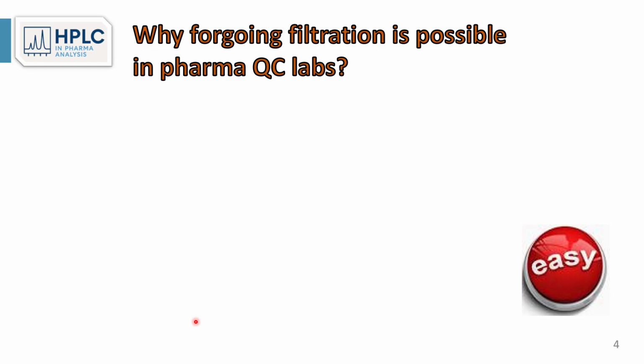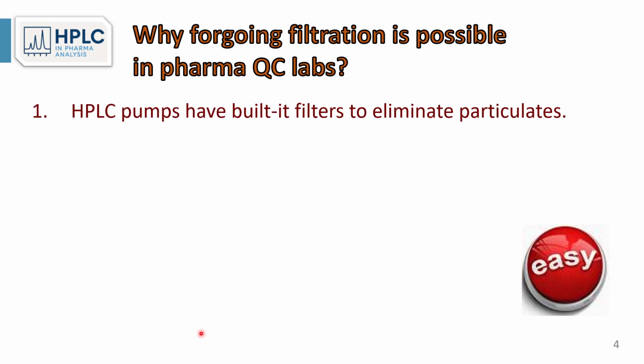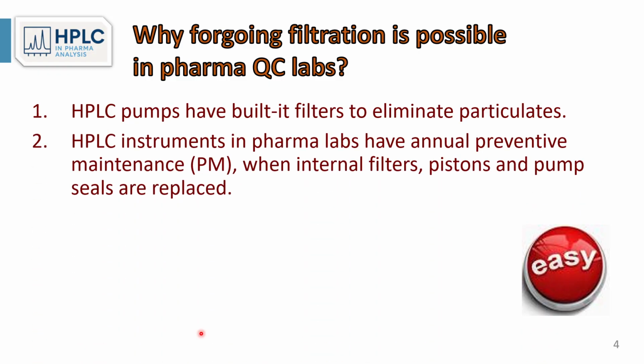Let's discuss further why foregoing filtration is possible in a pharma QC laboratory with trained analysts. First, HPLC pumps have built-in filters that eliminate particulates. Second, HPLC instruments in pharmaceutical laboratories, particularly in QC, have annual preventive maintenance when internal filters, pistons, and pump seals are replaced.